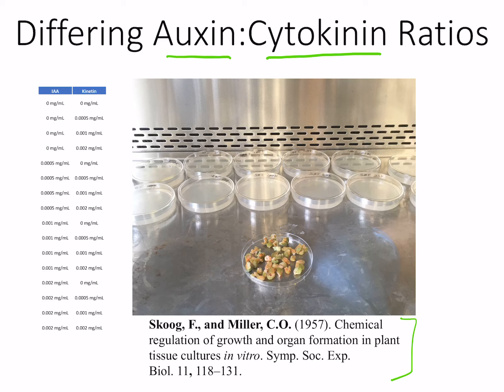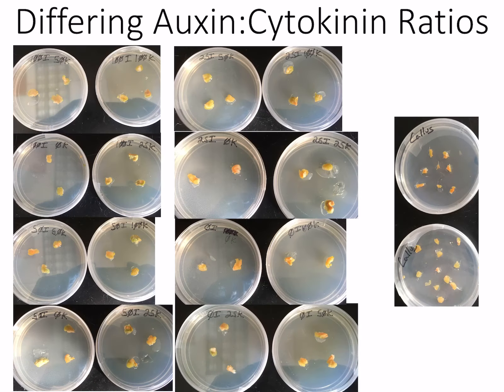So the callus, as you can see right here, I took it and cut it up — I took it off all the petri dishes and cut it into smaller pieces. I introduced it onto petri plates this time, all of which are sealed with parafilm, so hopefully we won't have any contamination problems. I also took some other callus and put it onto fresh callus medium, just to see if we could perpetuate these lines.